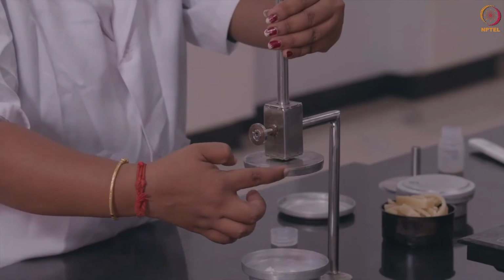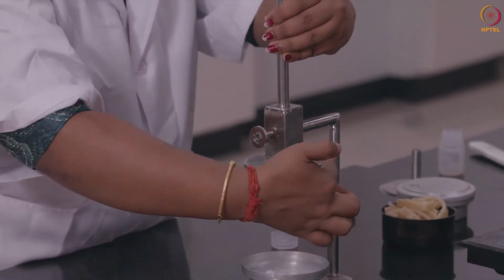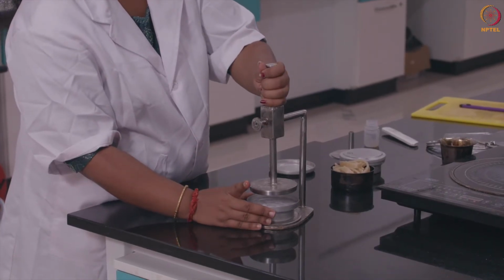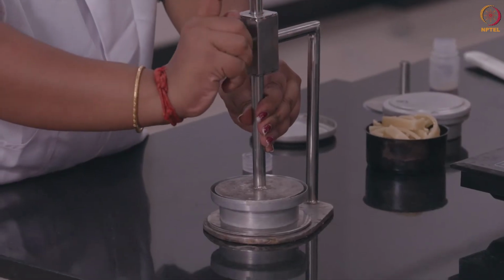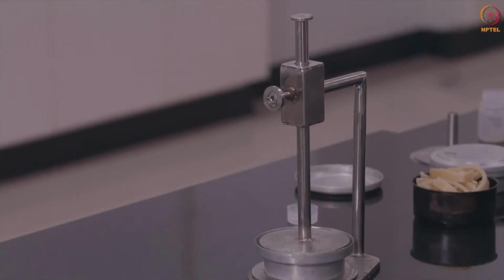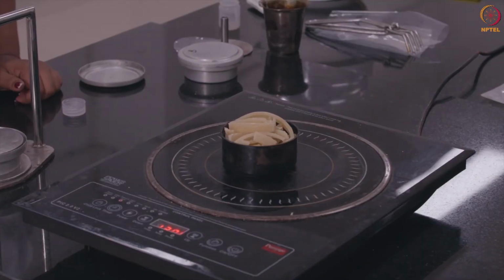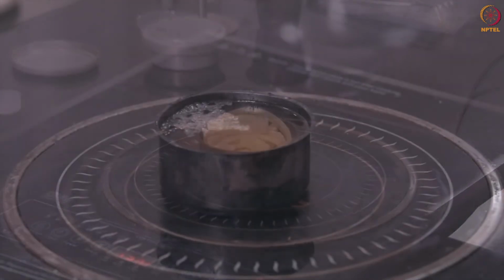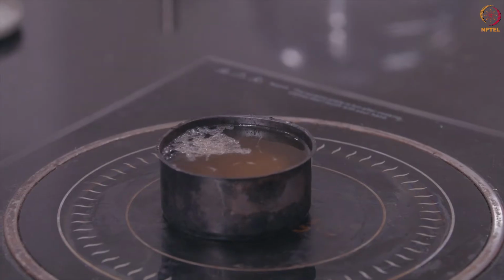Apply petroleum jelly on the sides of the plate so that it can be easily removed later. Make the film airtight using paraffin wax and microcrystalline wax in the ratio 60:40. This wax is first melted and poured over the plate.